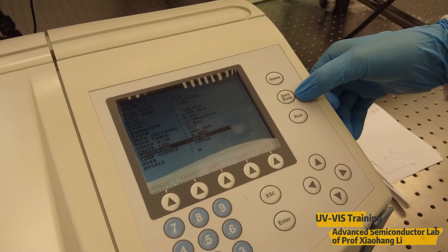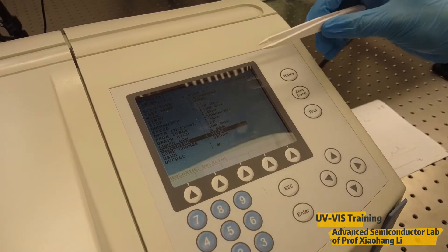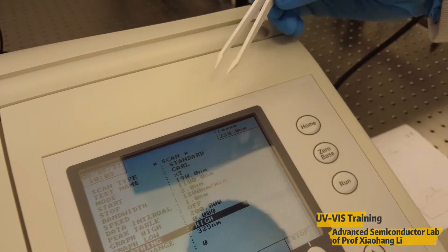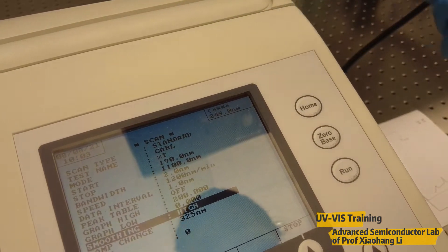By doing this kind of setting we can start to measure the baseline. By pressing the zero base we can measure the baseline. As you can see it will start to measure the baseline from 190 nanometer up to 1100 nanometer. Let's wait.